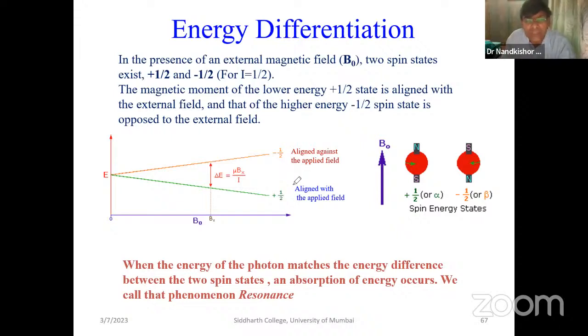Now come to the three words, NMR: the nucleus which has a half spin when placed in a strong magnetic field. That means M.